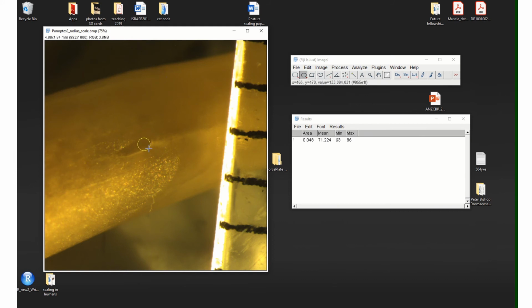Now we're going to repeat this a few times, so I'm going to click somewhere to remove my circle. I'm going to hold Shift, and I'm going to move it there. Maybe resize it slightly, still holding Shift. Yep, that looks good. Control M, got my second, and a third attempt there. I'm pretty happy with that. Control M. Okay, so there are my three numbers. I'm going to get an average of these.